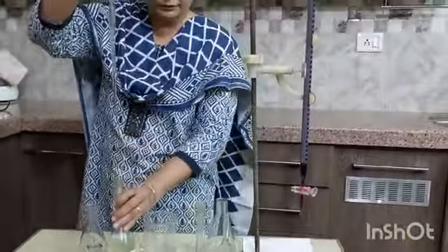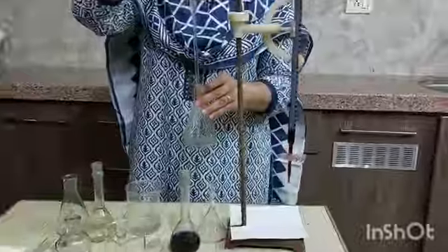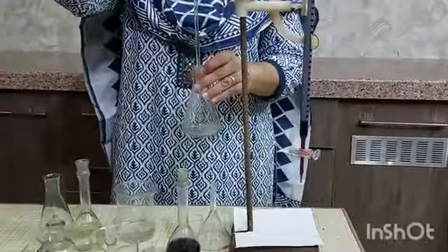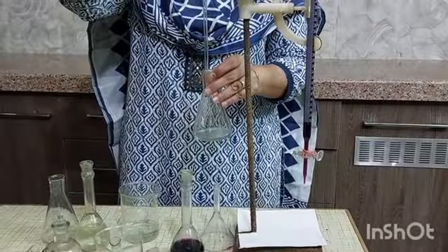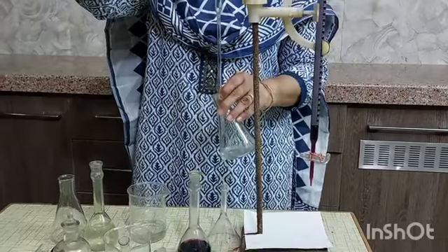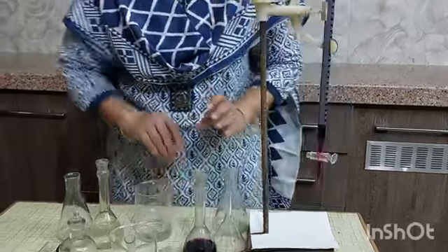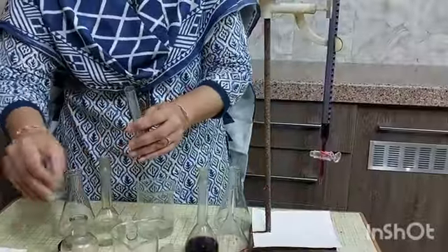Maintain the level and pour this 10 ml of ferrous ammonium sulfate solution into the conical flask. Add 2/3 test tube of dilute sulfuric acid.